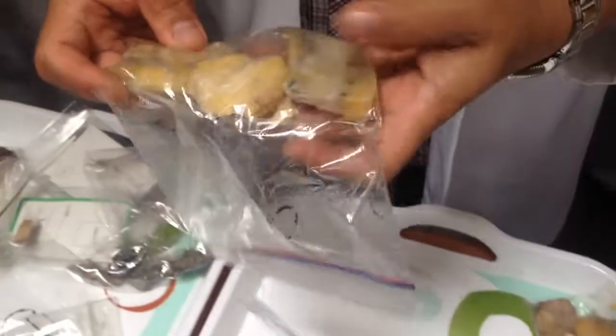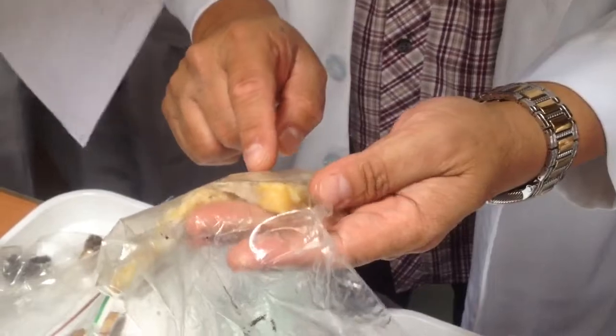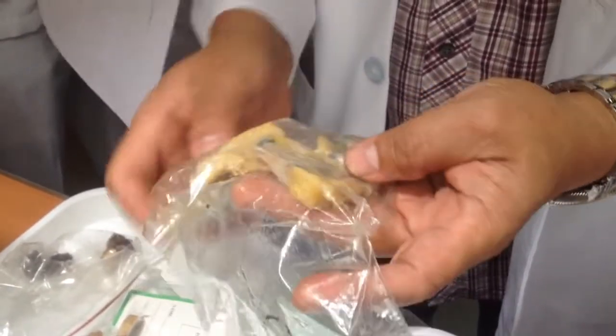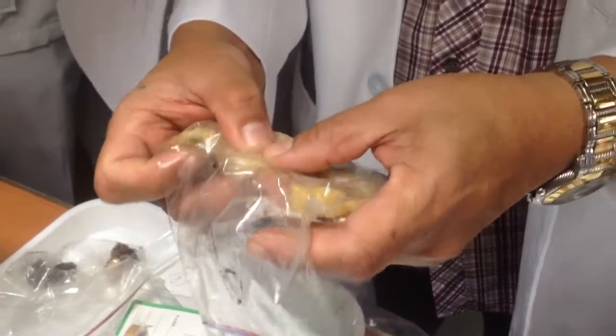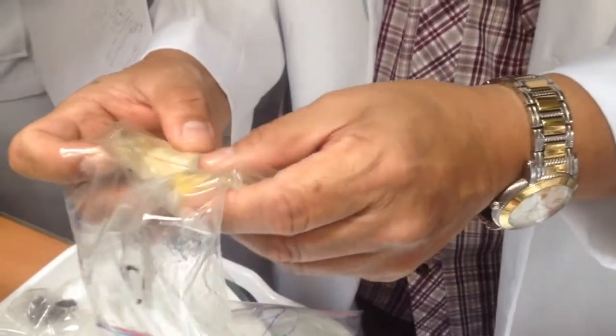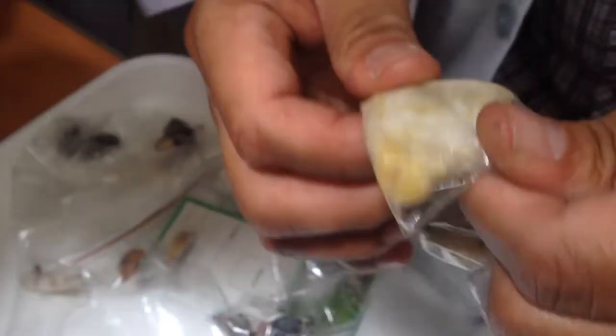In contrast, your fibrocystic disease is ill-defined. In this example, presenting as a gray-white to pale brown, ill-defined lesion, soft to firm, with a smooth cut surface. You see those cavities, small cavities? Small cavities.